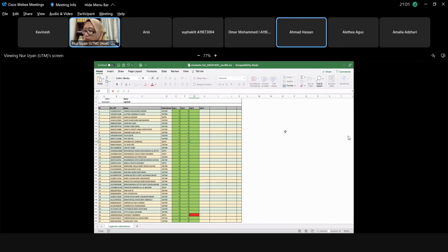Yes, doctor. Okay. What are the equipment that is going to be used in this experiment to determine the concentration of zinc in a solution? Firstly, we'll use 100 milliliter volumetric flask and the dropper. No, I mean the name of the equipment, Hassan. Oh, the name of equipment.